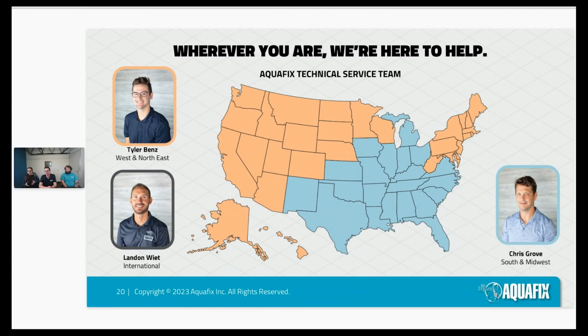And also microanalysis can be helpful because, as I talked about with nocardia, it has stages. If you're able to get it while it's still young and treat it then, you can save yourself a lot of headache. Yeah, exactly. The bugs don't lie. What we see is exactly how your system is at that current time and place. So for some of you that don't necessarily have a foaming issue, if you were to do a microscopy, sometimes you will still see, like Natalie said, the early stages of growth. So at that point, you can catch it before it even becomes a problem. All the more reason how microscopy can help you.